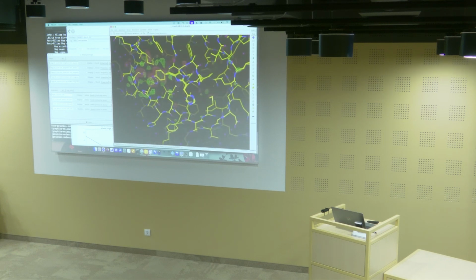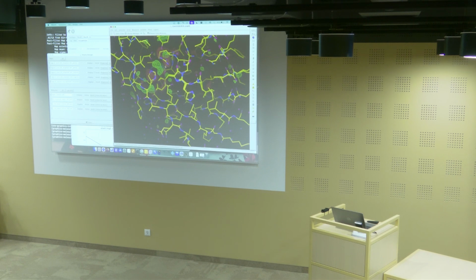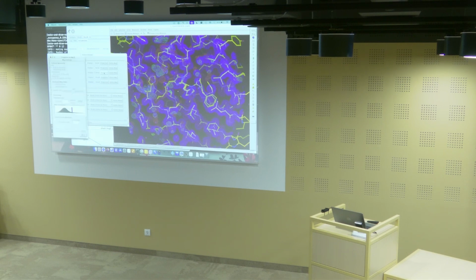So what we can see here, this is being removed in my triggered state. This arginine is moving over there, and this histidine is also moving over here. Then we have all the results of refinement, the other models, so we keep just the input model. And then the other maps here, these are my initial extrapolated maps. Let's quickly change that color to blue, which is what most crystallographers like.